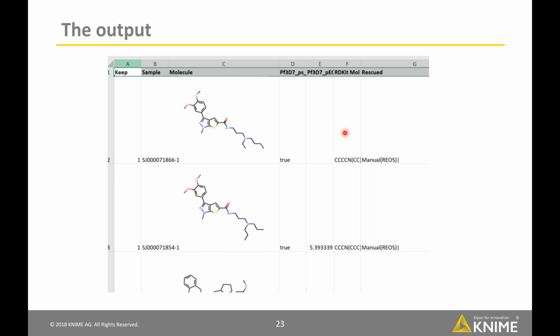One thing I forgot to say, Serina's tutorial is Python based. If you go to GitHub, you'll see there's a really nice notebook she did that has a lot of text explanation, but it's Python in the end. I'm in the process of taking the pieces of that and translating each of them into Knime, and I've not gotten to the point yet of doing the machine learning pieces, but that's coming.